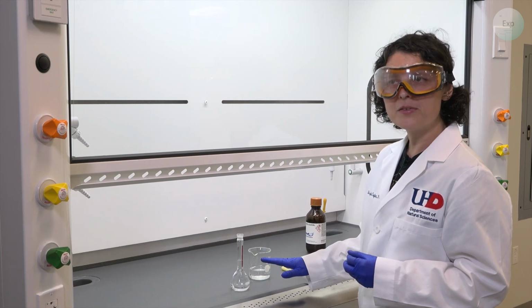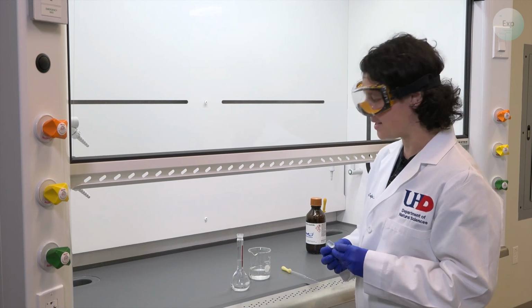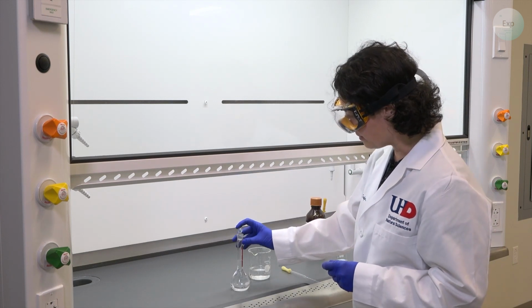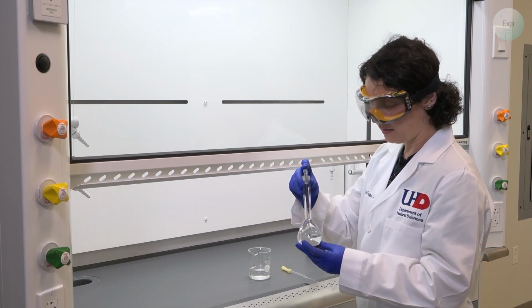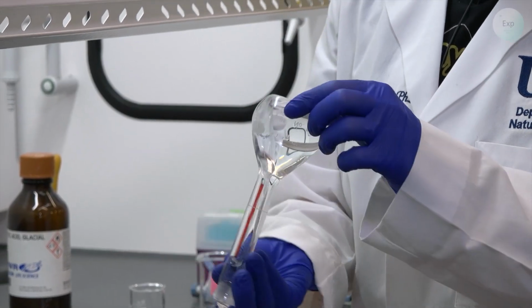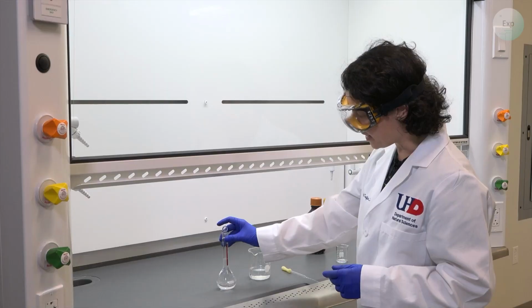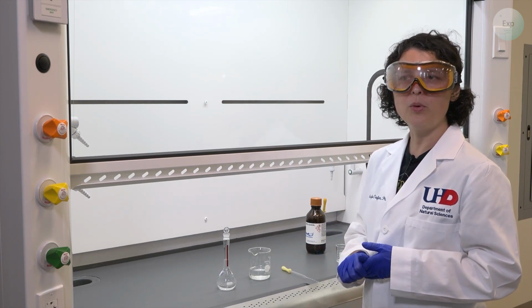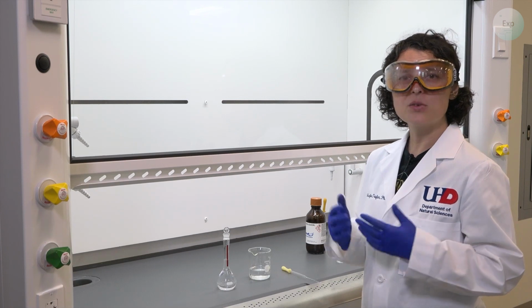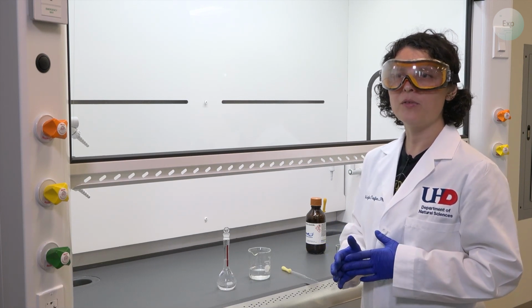Now we have the right amount of solute in here, and we have the correct volume, but it is not homogeneous yet. Next, we put the cap back on, and then we're going to move it back and forth approximately 3 to 5 times, and then set it aside. At this point, we have a homogeneous 0.1 molar acetic acid solution. As always, when making an acid solution, it is important that we standardize them before we use them for additional analytical purposes.